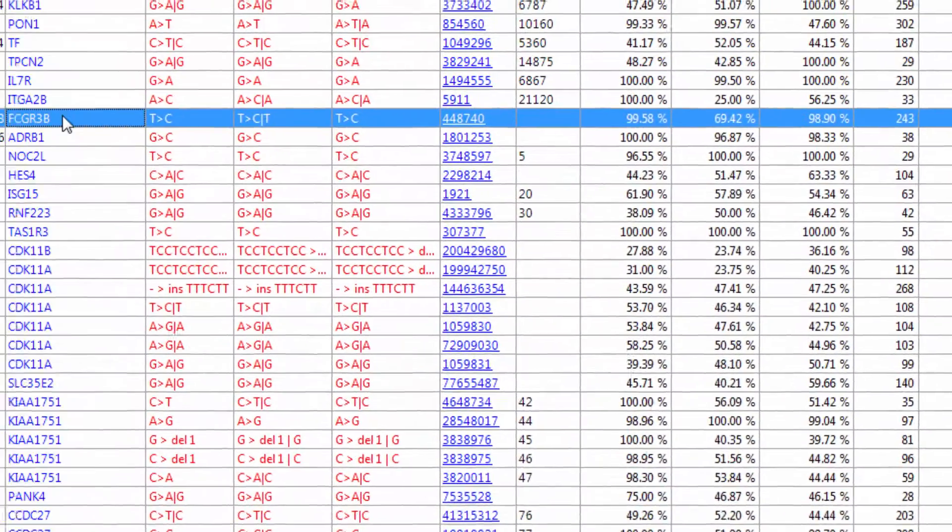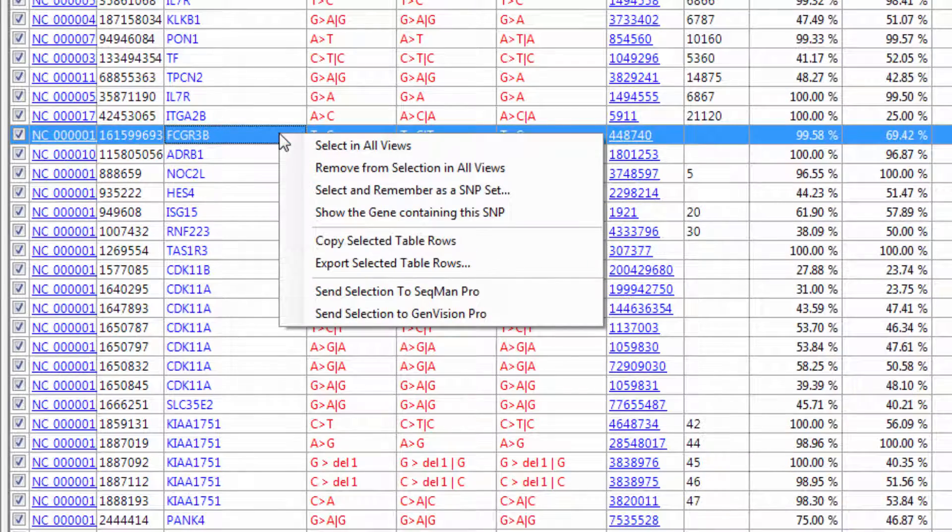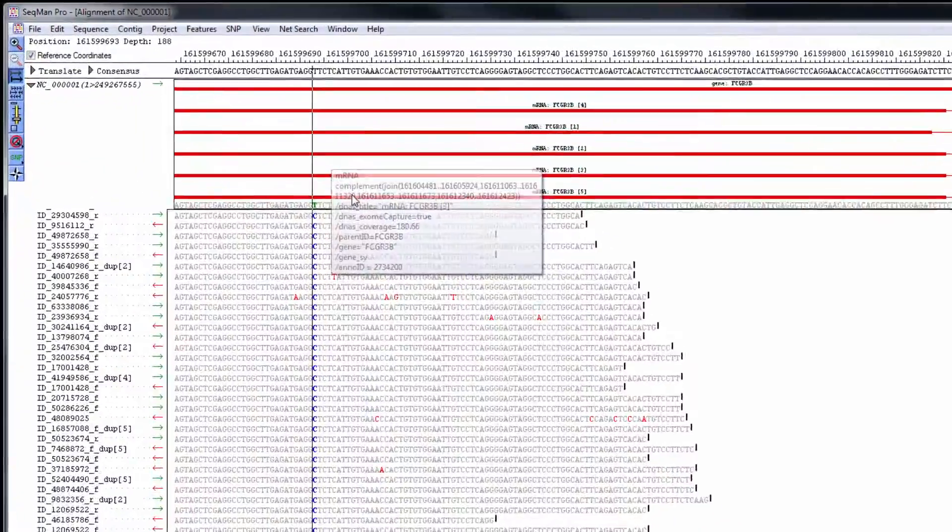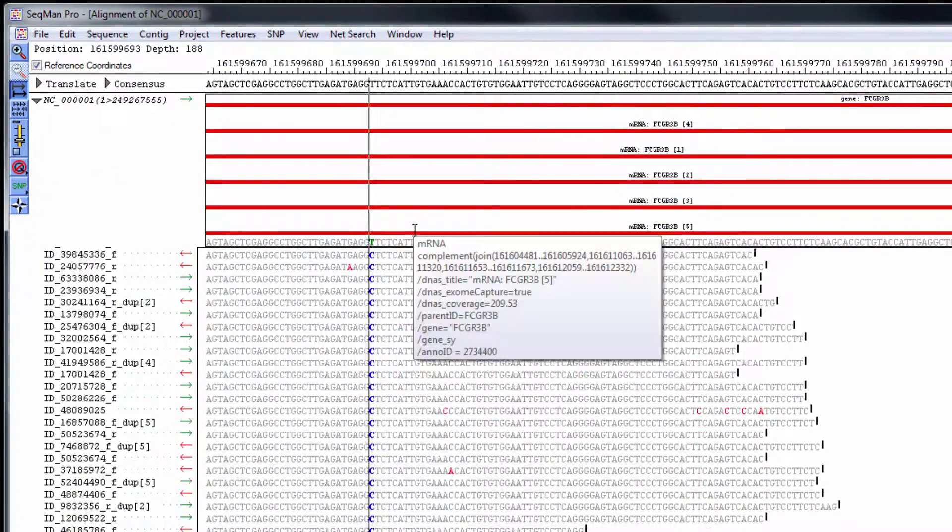Once I find a gene or variant of interest, I can make a selection, right-click, and send it to SeekMan Pro to view the read alignment at that position.